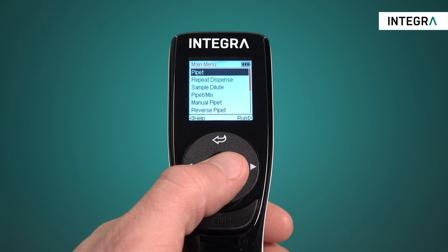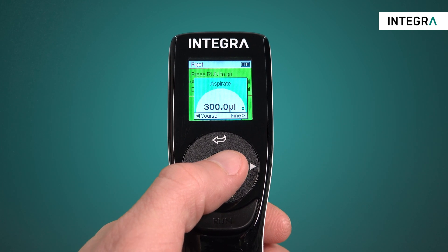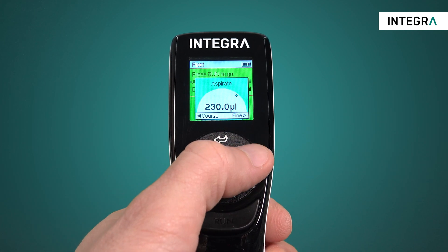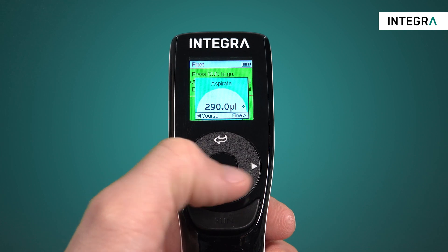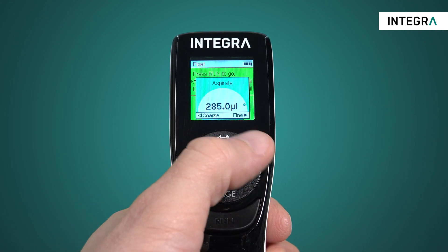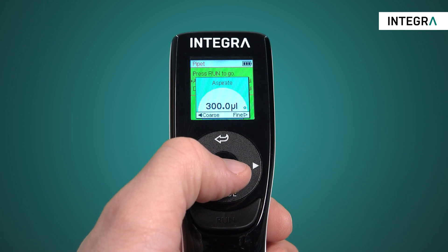To start, simply enter the program from the main menu and edit the desired volume with one hand by using the touch wheel. The increments can be changed between fine or smaller and coarse or larger. This really reduces the amount of time needed to change the volume and helps spare your thumb from unnecessary movements.